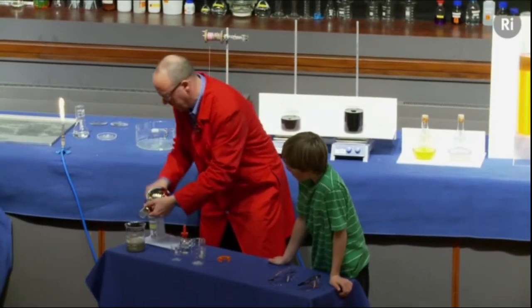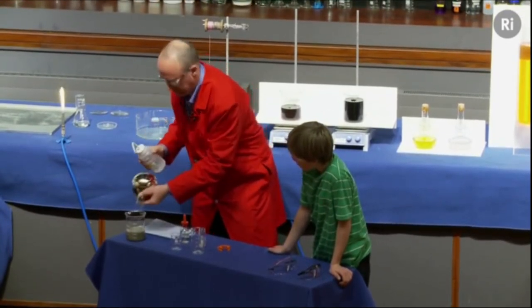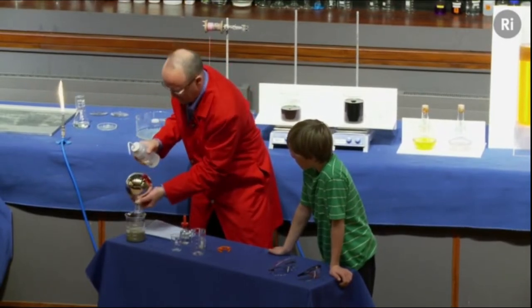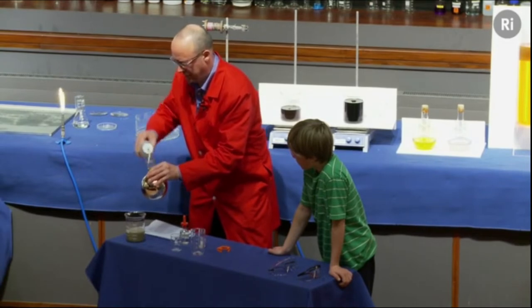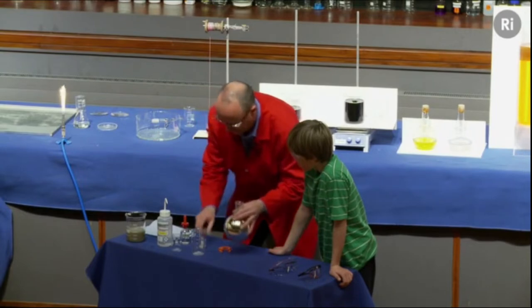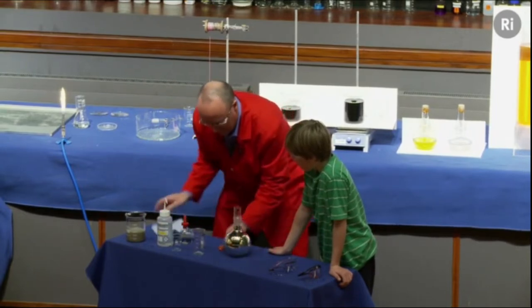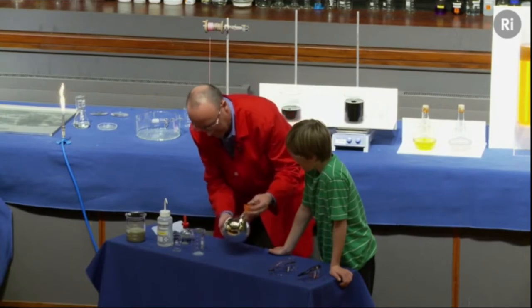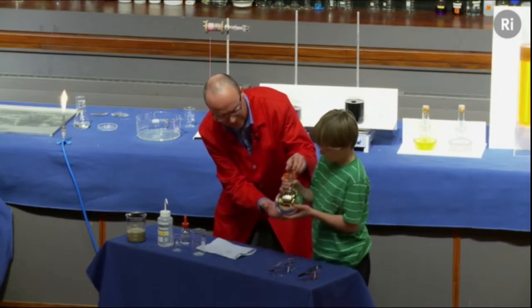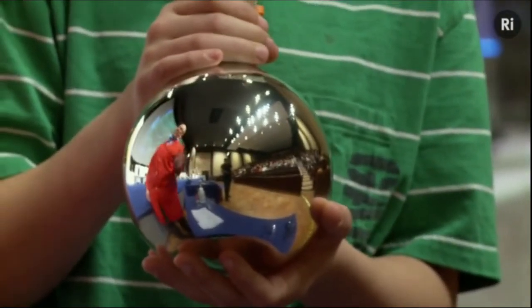And then I'm going to rinse this out with distilled water. I'm going to rinse it out a second time. Rinse it out a third time. There we go. And I'm just going to put that on, dry this off, and put the clip back on. And if you'd like to just give that a little polish, there we go. If you'd like to hold it up by the neck, that's it. And if we bring a camera in and have a look at this, we've got a lovely silver mirror.